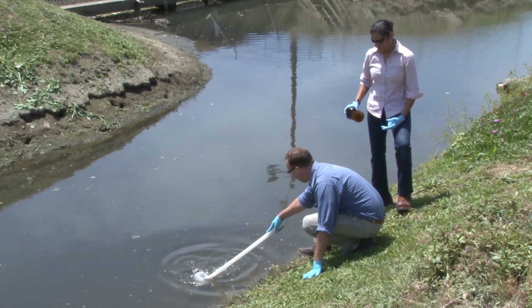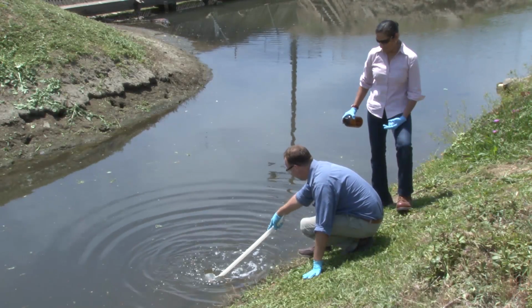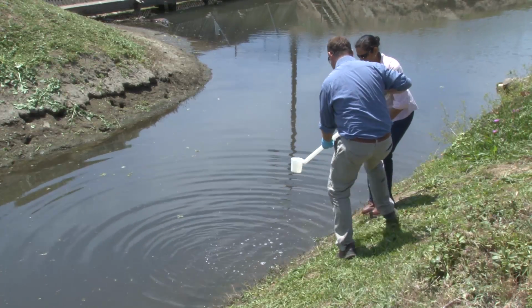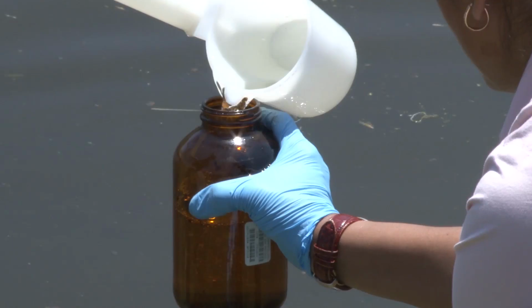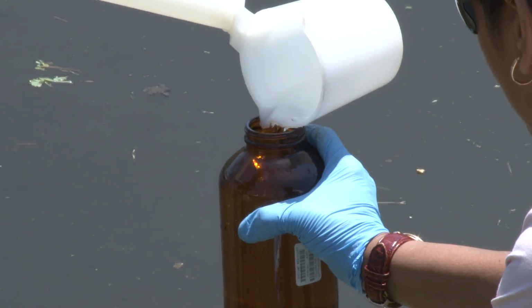Collect a sample of stormwater either directly into the sampling bucket or via scoop. Avoid collecting excessive amounts of solid materials immersed in the sample or floating on the surface. Transfer the collected samples from the bucket to the appropriate pre-labeled sample containers, keeping the sample well mixed during transfer.